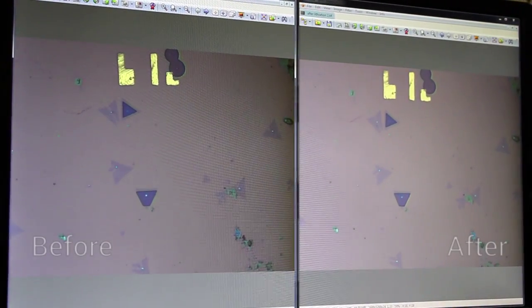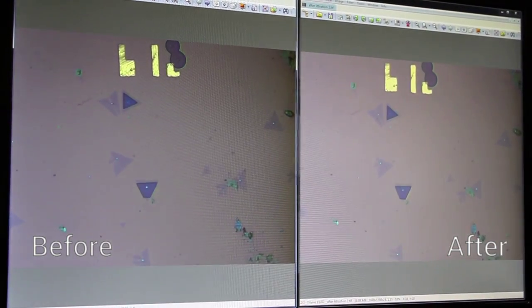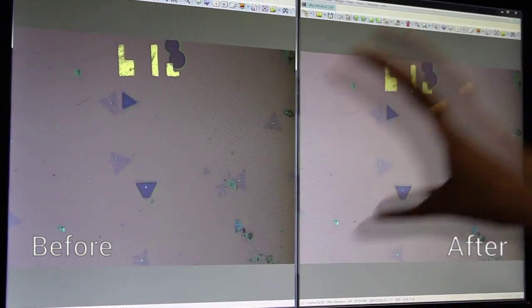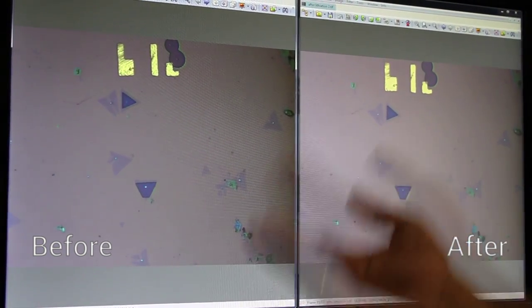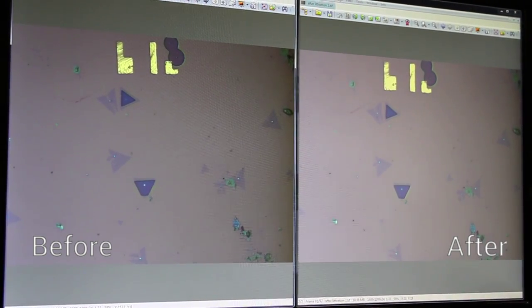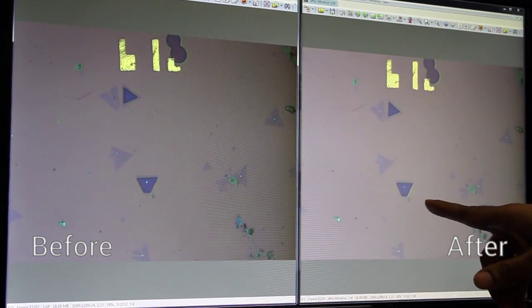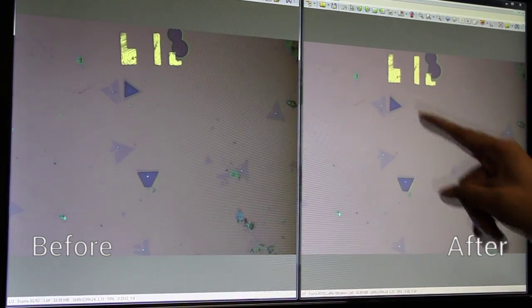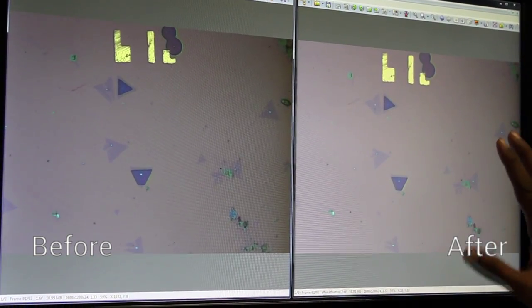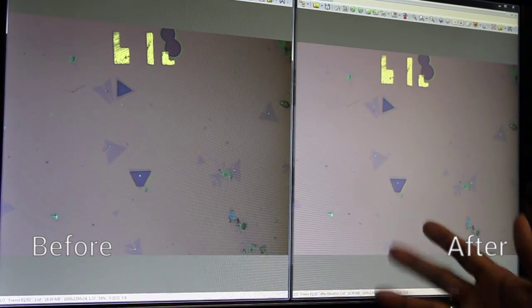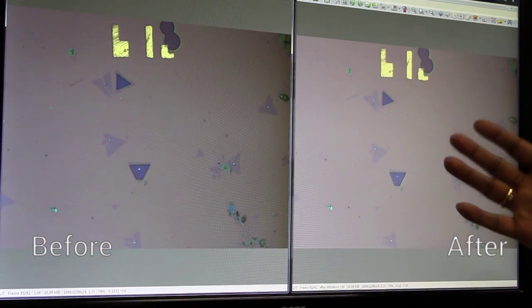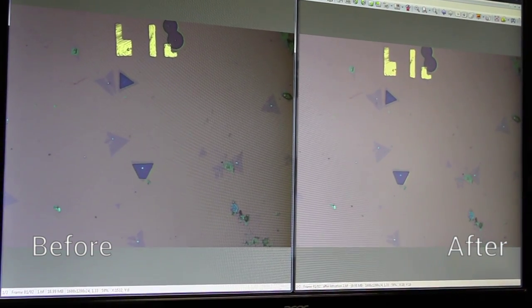Here are the optical images. This was the image taken before doing anything to the flakes, and these are the images taken after lithium intercalation, hexane washing, and water washing. We can see that the flakes are still intact and the surface is clean. The two images look similar, but the exposed region has been treated with butyllithium and is now phase-converted to the 1T phase.